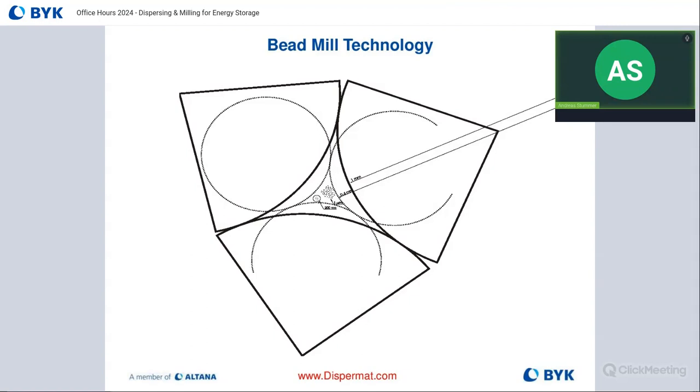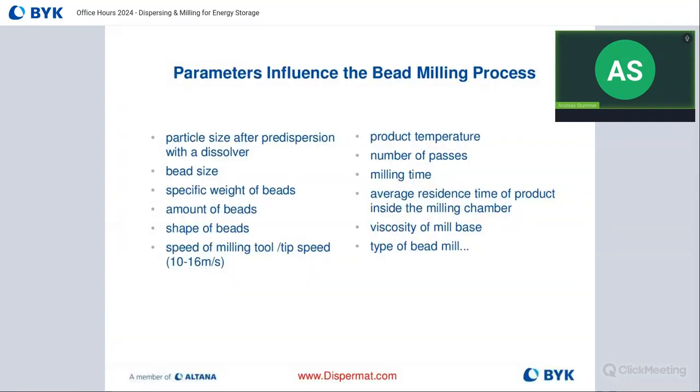And that's kind of like what's happening inside of a bead mill. So the beads would be acting like your hands, and the particles would be the rubber duck. As the beads come together at high velocities, that rubber duck or that particle cluster would be pushed away, and that pushing motion, that shearing force, is enough to break up the binding forces and make the particles smaller. Of course, you can also crush some of these particles, but the idea is to break up the binding forces, and you're really achieving that through those shearing motions, and that's what happens inside of a bead mill.